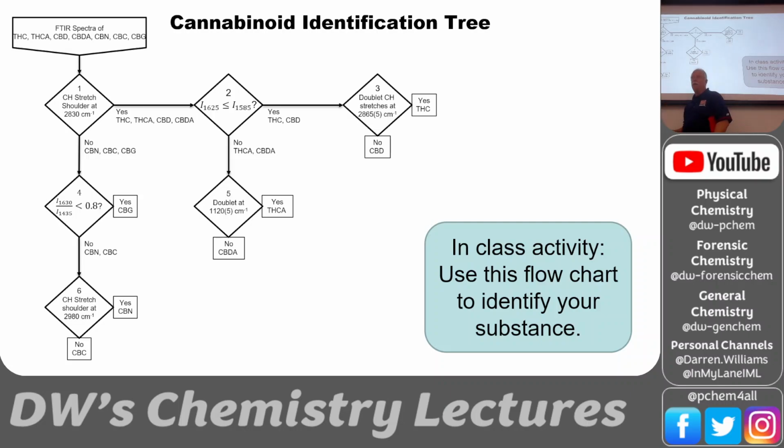Okay, let's do question number 2. Look at the region of 1625 and 1585. This is the carbonyl stretch region. The question is whether 1625 is less than or equal to 1585. If you can say yes to that, it's not one of the acid groups. It's THC or CBD. And then THC has a doublet CH stretch at 2865.